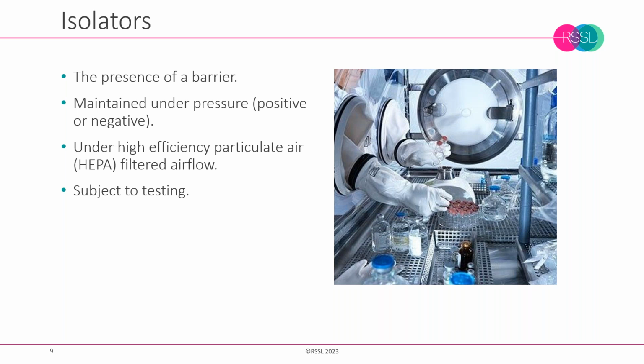It's also important that there is a rapid airflow inside the isolator. Now, some isolators inside can be designed to be turbulent flow and some are unidirectional airflow. There's always an advantage with unidirectional airflow in being able to sweep contamination away from the critical zone and to expunge that from the isolator more rapidly.